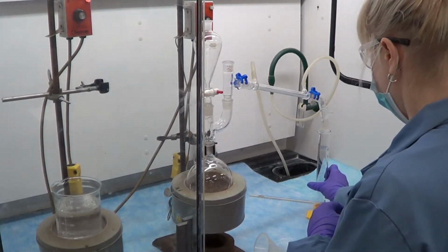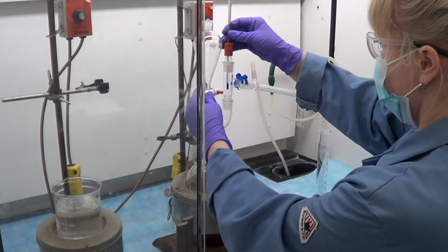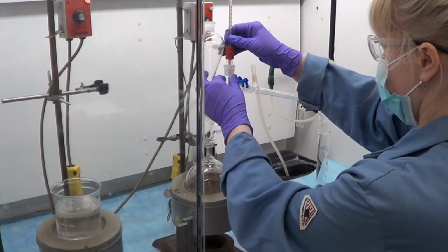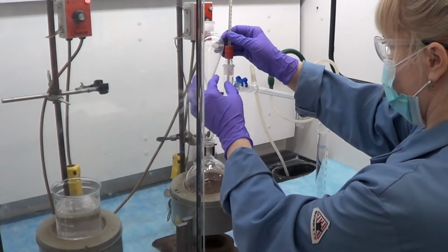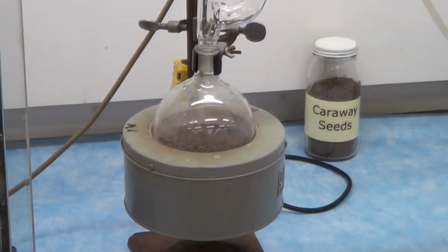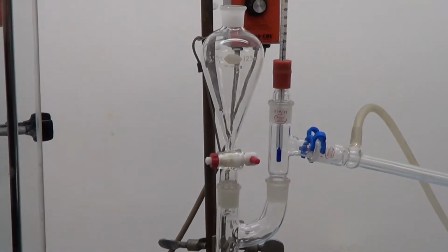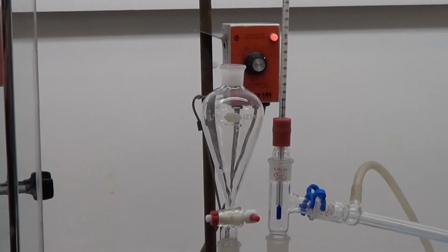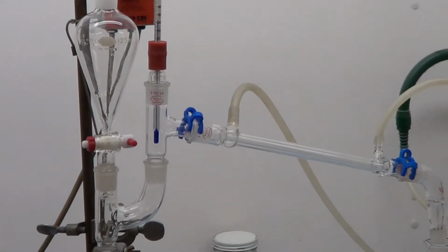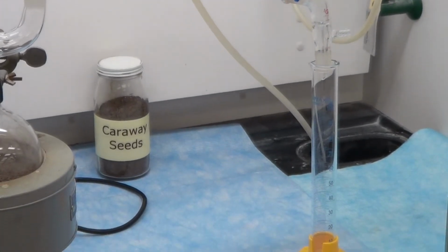A graduated cylinder is then placed at the opening of the vacuum adapter, and the thermometer with the thermometer adapter is attached to the still head. The thermometer is then adjusted so that it lines up with the opening of the condenser. The water is then turned on and the round bottom flask is heated. During this time, take notes of any smells that may be present of the caraway seeds or spearmint leaves and compare between enantiomers.